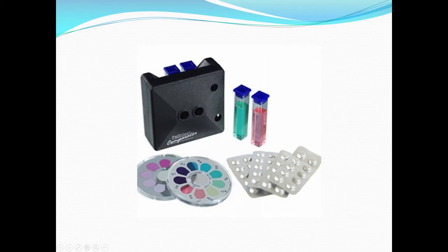These are the different colors which will give you specific wavelength absorbance, and these are the reagents kept in the form of a tablet which you can dissolve and then determine. These are very low end and not meant for scientists. Routine chemical operators in a swimming pool or a jewelry shop use these, and they are very useful for a quick and rough estimate.